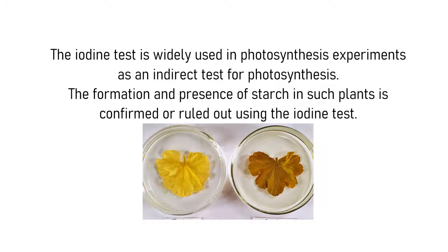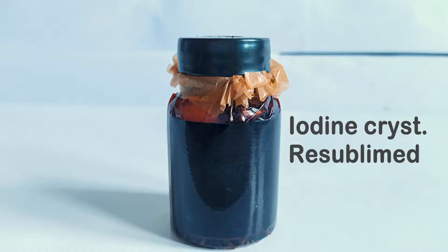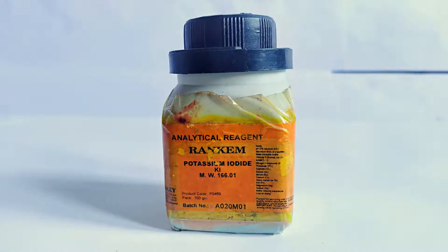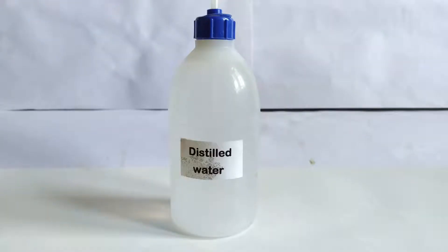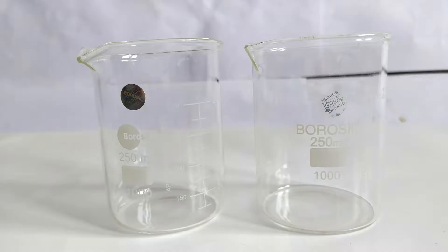To prepare 100 ml each of these two types of iodine solutions, we will need the following: elemental iodine resublimed crystals, potassium iodide crystals, distilled water, and two beakers of 100 or 250 ml capacities each.